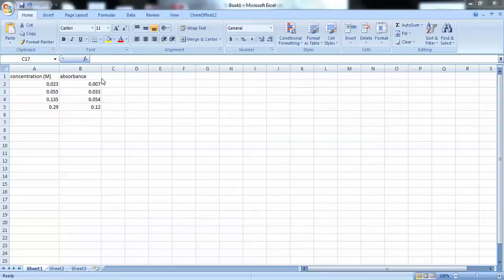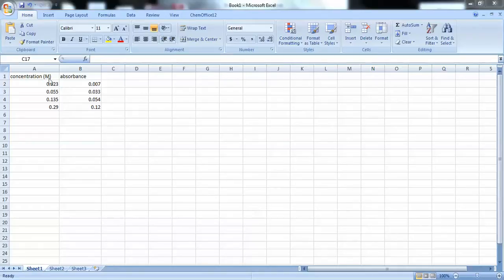And on my right column, I have absorbances. And these are the absorbances that you took from your spectrophotometers. I've labeled both columns just so I don't get confused as to what these numbers mean.